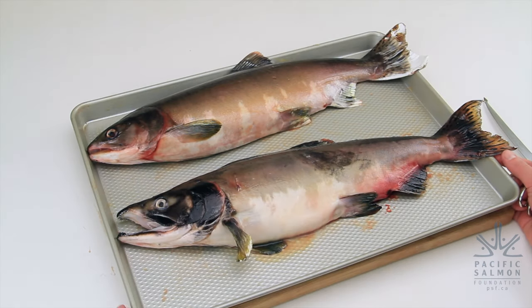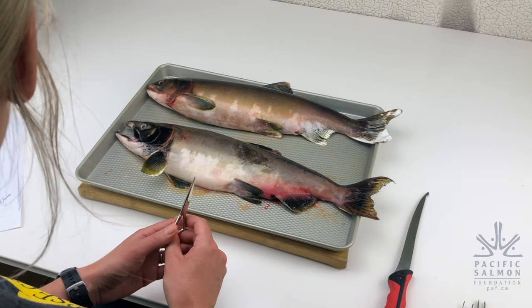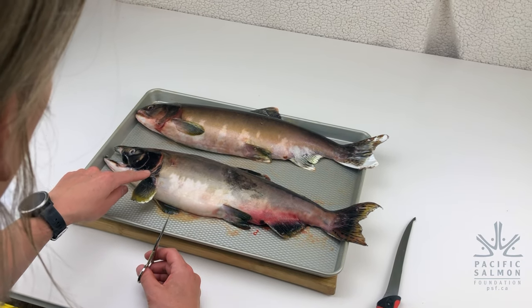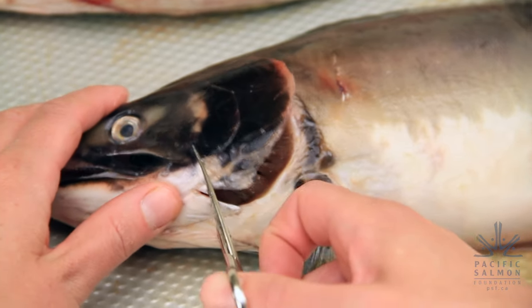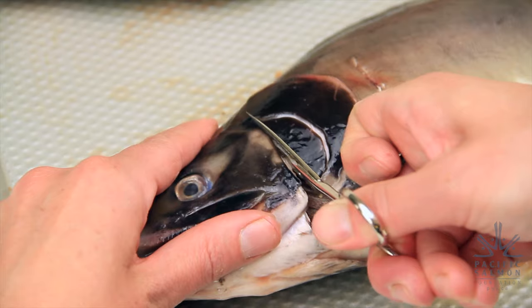Now that we've looked at the outer features of these pink salmon, we're going to start looking at some of the inner features. We'll start by looking under the operculum — we're going to cut off the operculum so we can get a better look at the gills.